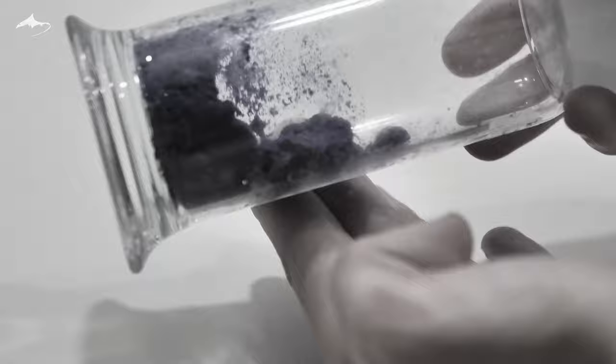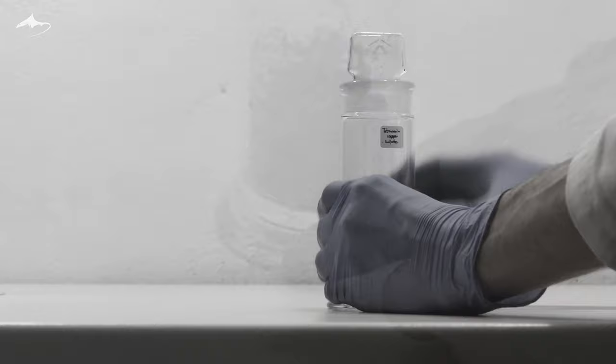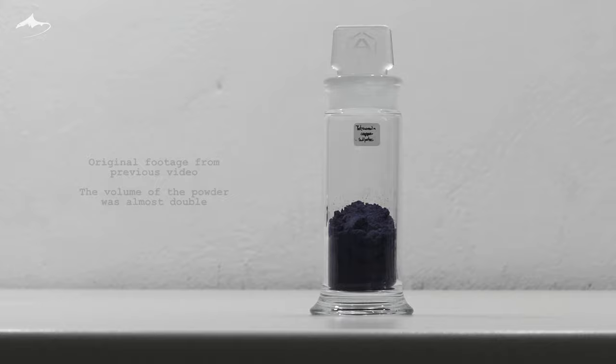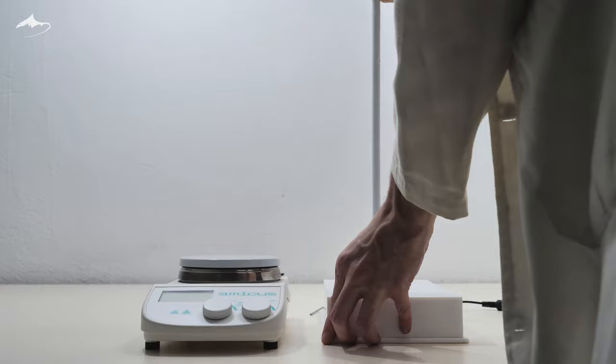So here is the jar after 16 months. If you watched the previous video you may have noticed that the volume of the powder has decreased considerably. As I mentioned in that video, the yield was over the unit as it contained lots of ethanol from the washing step. This ethanol has been lost to evaporation during storage because the container is not airtight.